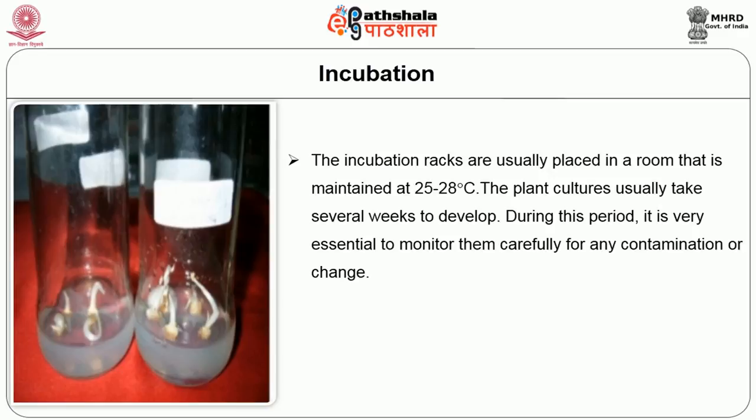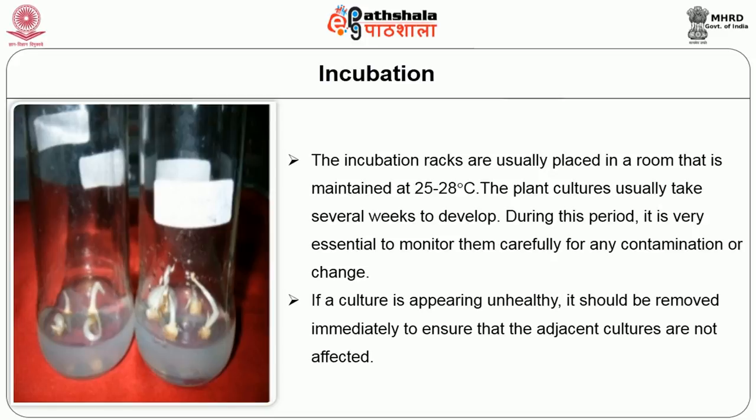The plant cultures usually take several weeks to develop. During this period, it is very essential to monitor them carefully for any contamination or change. If a culture is appearing unhealthy, it should be removed immediately to ensure that the adjacent cultures are not affected. Now, we shall consider how propagation and subculturing are done.